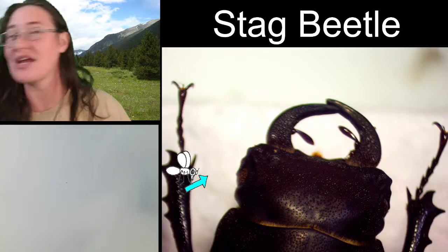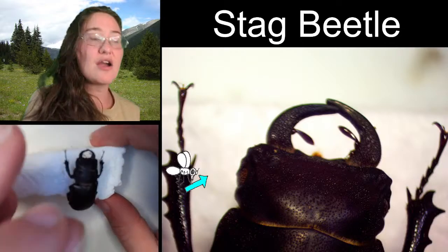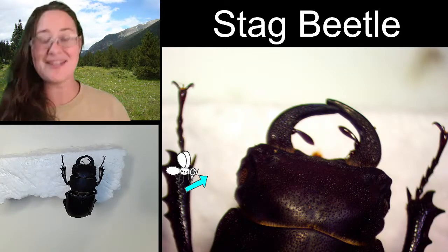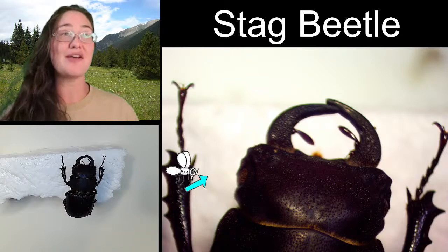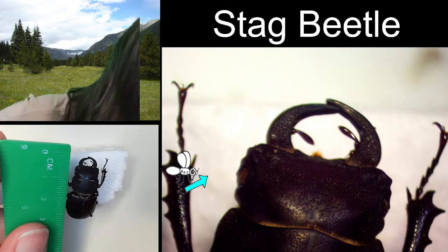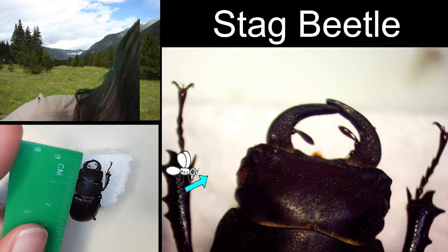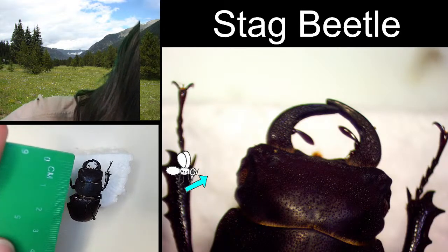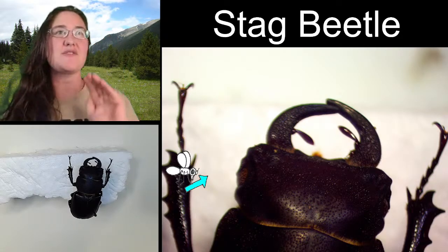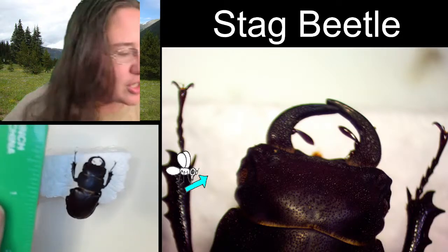So this is a stag beetle that was collected in Utah. If we throw it underneath my desk camera here we are going to be able to go ahead and measure it. This is a male stag beetle because you can see that it has these ridiculously large mandibles — the females have significantly shorter mandibles. Going from the front of the mandibles all the way to the back of the abdomen, it's probably 3.1 or 3.2 centimeters if it was all straightened out. The abdomen is falling just a little bit on the specimen, so it's angled a little bit down.